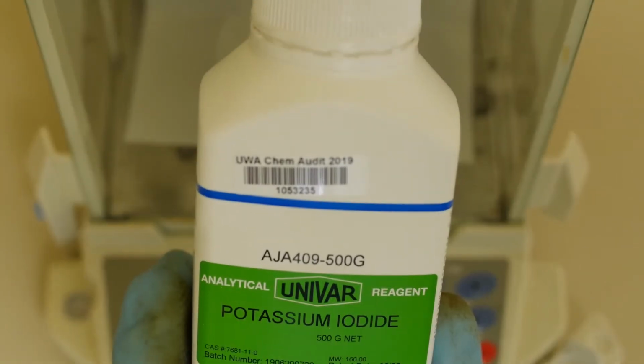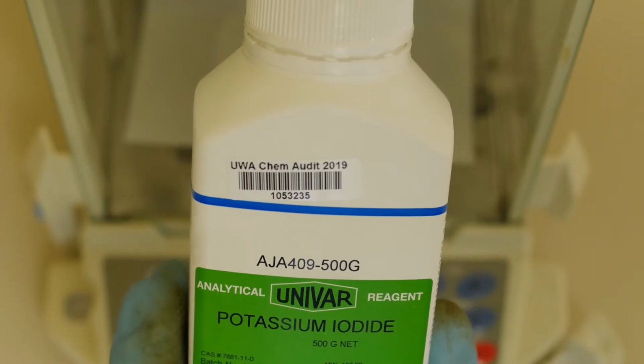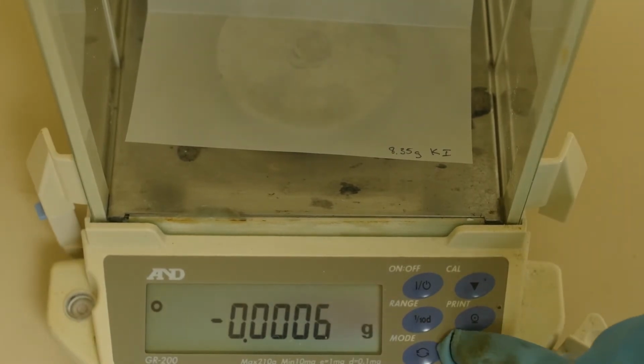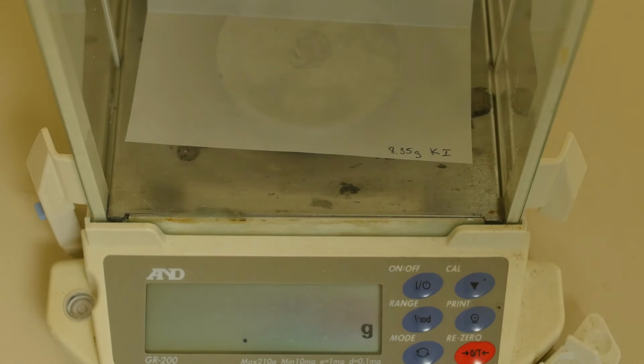In the second experiment of this lab, we must make up a 500 milliliter solution of 0.1 molar potassium iodide. To do that, the analytical balance is used to weigh out 8.35 grams of dry potassium iodide.